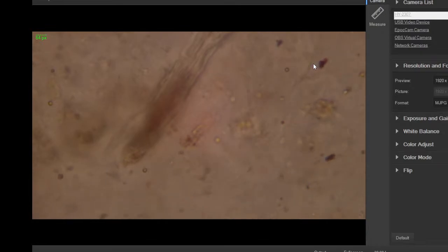So this is not the typical one you'd buy or find in the Vietnamese places for pho, but this is probably a little bit thicker, and maybe slightly better ingredients. It's not a cheap sauce, and I'm not going to dilute it. I'm just going to put a drop of it on the slide and see how that looks. Might be very dense, we'll see.